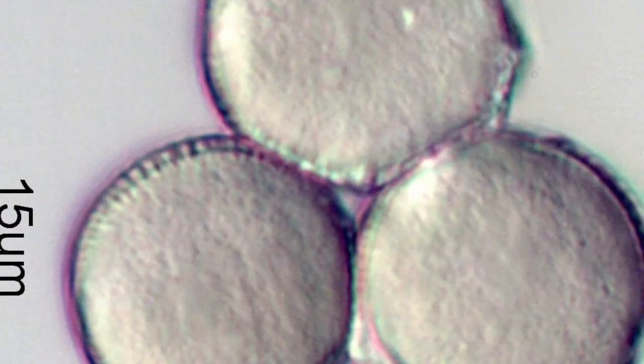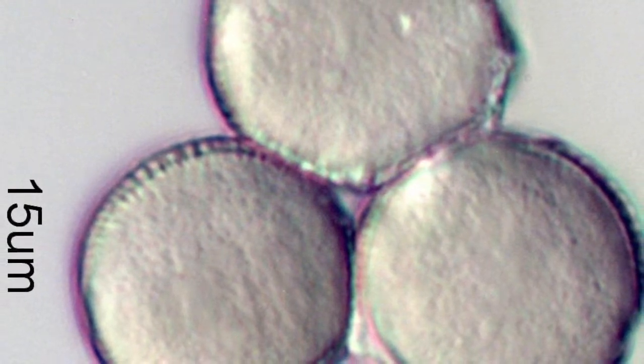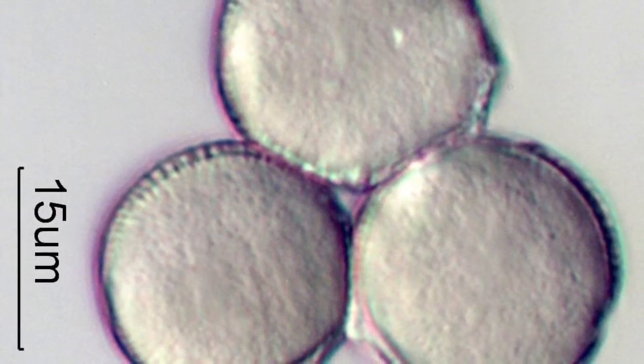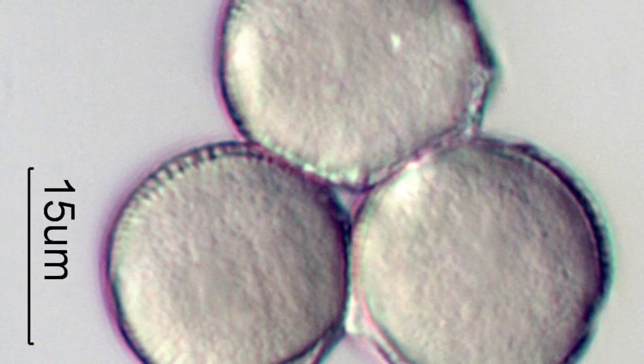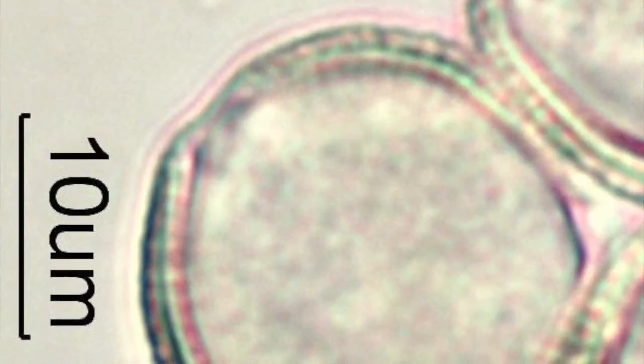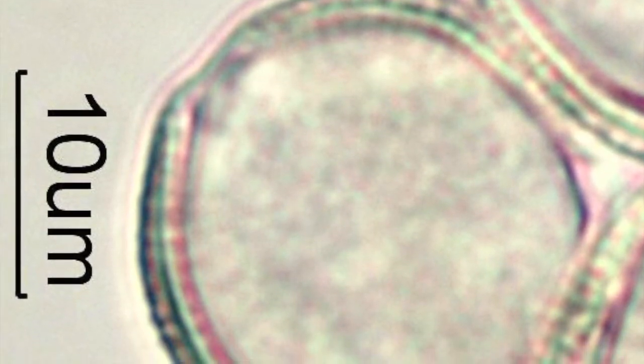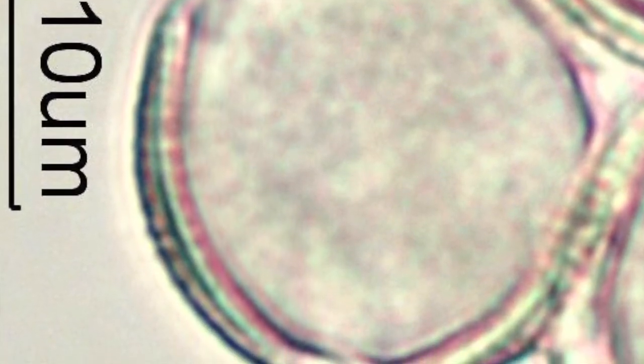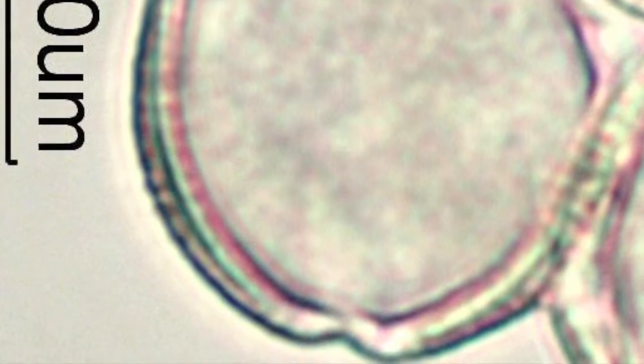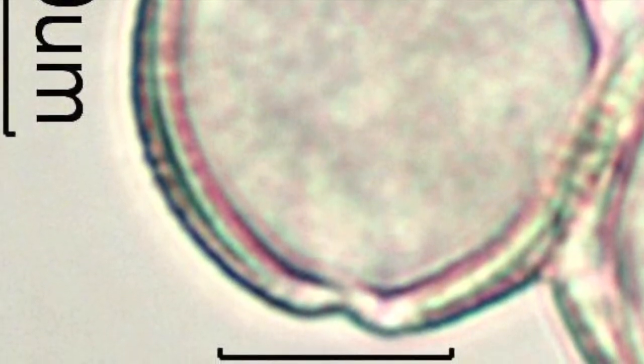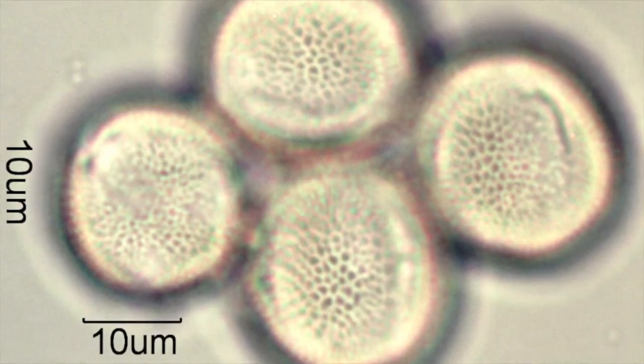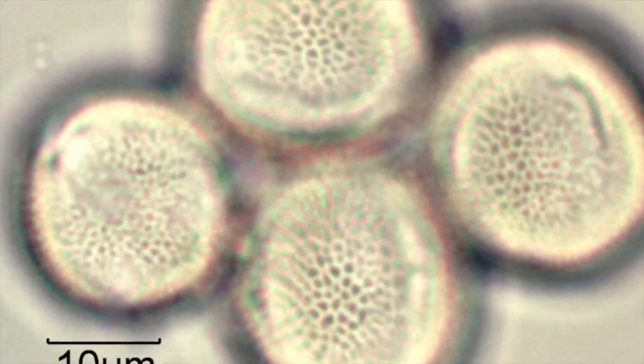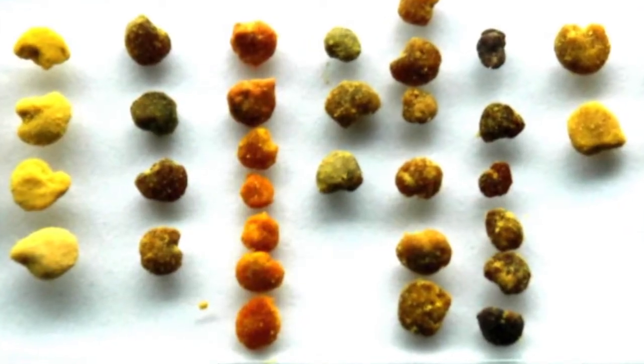Now what we're going to do is look around in the field of view and see if we can find a pollen grain that actually shows us how many pores or how many fissures might be in these typical grains. And here we have one in a nice orderly position. We can see that it actually has three different colpi, three different fissures, symmetrically placed around the grain. So this is a tricolpate grain. These characteristics are sufficient to identify this particular plant as rapeseed, the plant that canola oil comes from.